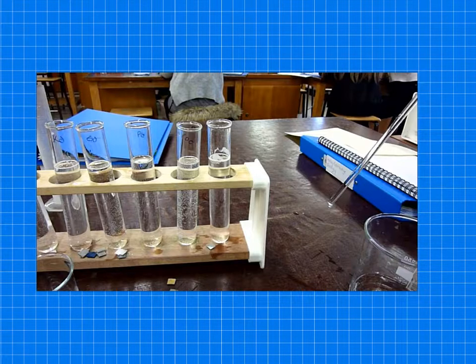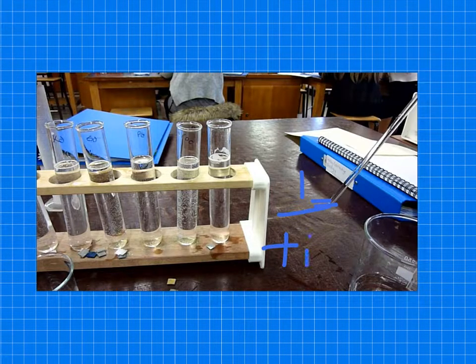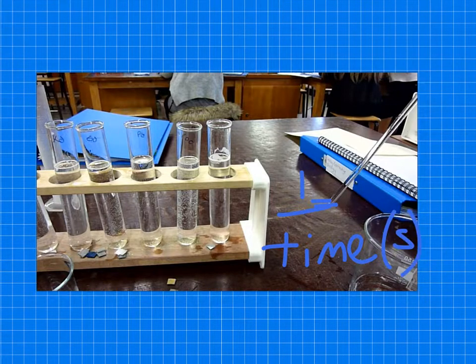So once the students have repeated this three times, and they've done it at each concentration, they worked out the mean, and then they needed to work out the rate of reaction. So rate of reaction is one divided by time in seconds. And they worked out the rate of reaction. So I'll show you the kind of results they should have got.